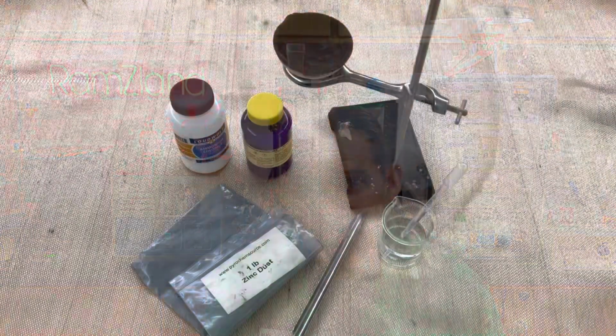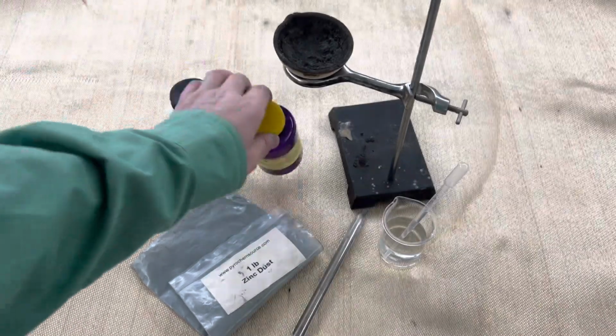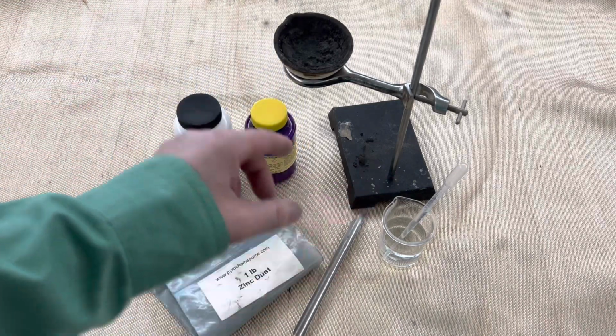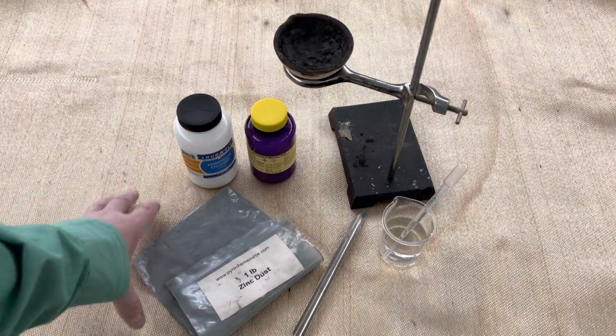Check this out. For this investigation, I'm using ammonium nitrate, fine zinc dust, and ammonium chloride as a catalyst, a drop of water, a crucible, because this gets really hot, on a ring stand, and a welding blanket.